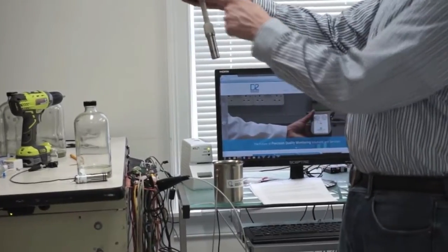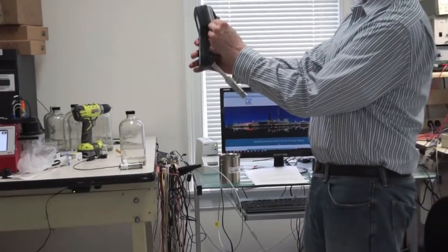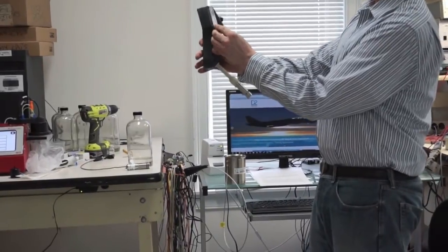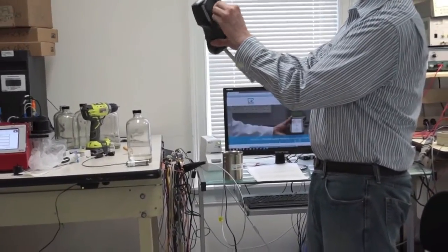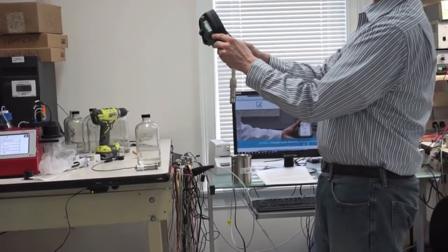It has the sensor tip in white Delrin, the power source, a USB input which connects to the computer, and a grounding point if you're out in the field.